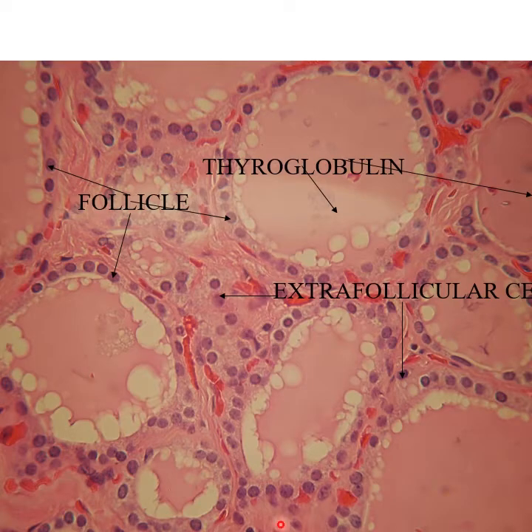All right, this is a thyroid gland. This is a fairly easy slide, and what you'll notice, it's got these fairly large and obvious circular structures here. Keep in mind this would be three-dimensional. This is a section, so what look like circles on a section would be spherical structures, and they're made up of a single layer of cuboidal epithelial cells. I'm outlining them here, and you can see the nuclei to use as a guide. I have a hard time drawing with a mouse, but these are the cuboidal cells right along here.